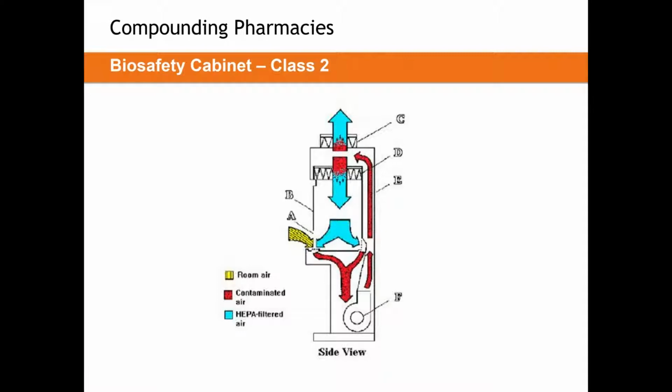By far, the most simple way to control one of these is to set constant volume. And we'll dig into airflow control technologies in a little bit, but this could be mechanically set constant volume. This could be a controlled constant volume. But the easiest way is to set it at, say, 500 CFM and never ever change it. The next way we might see this, and this is a fairly common approach, is to do a two-position type of exhaust.